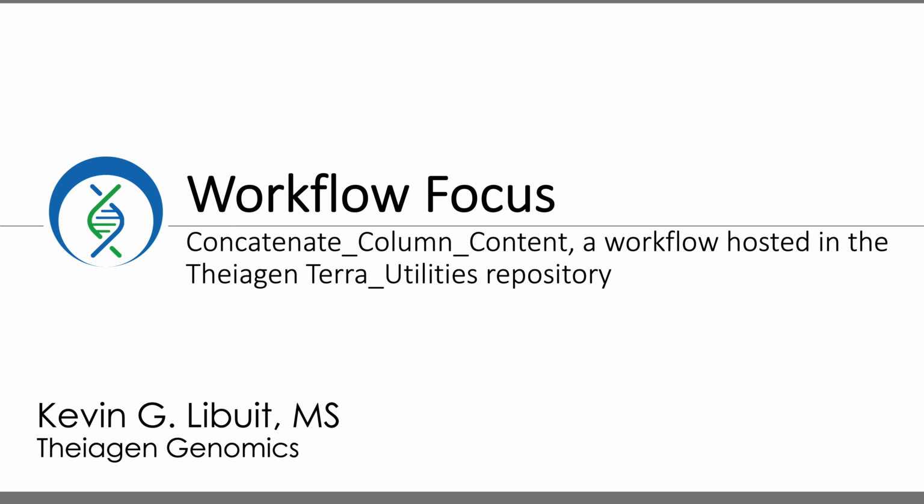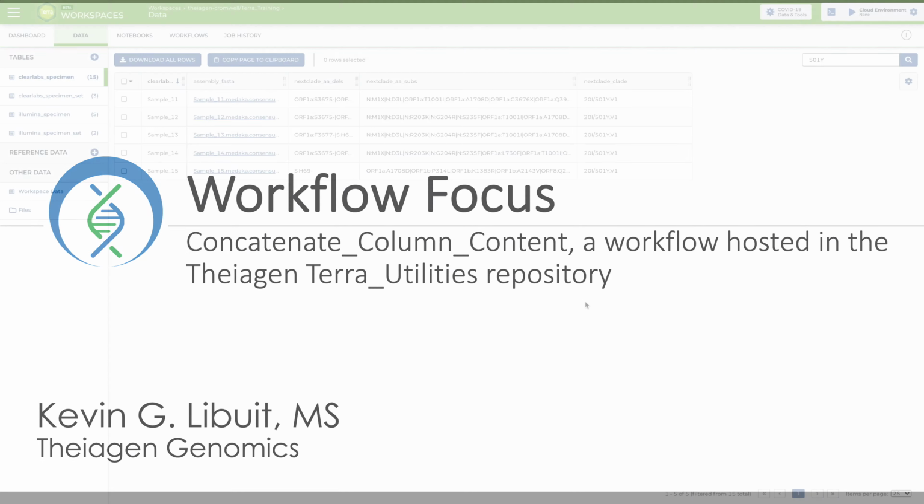But in today's example, I'm going to demonstrate how to use the Concatenate column content workflow to combine assemblies into a single file that can be used for downstream analysis with tools such as Nextclade. Okay, so with that brief little intro, let's get into it.